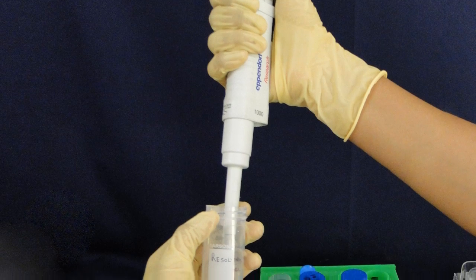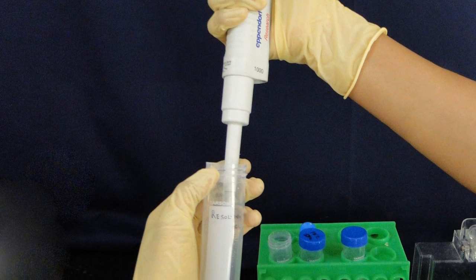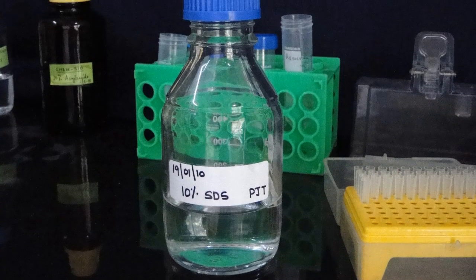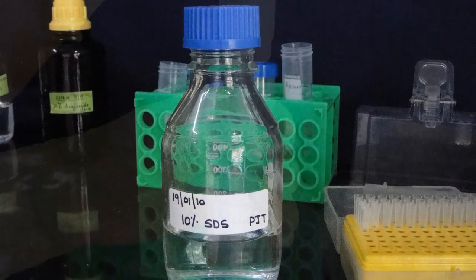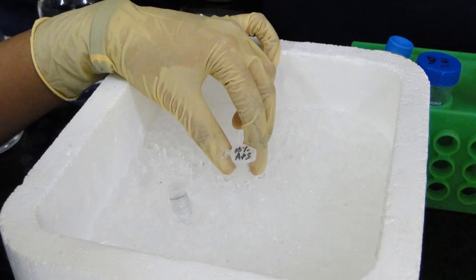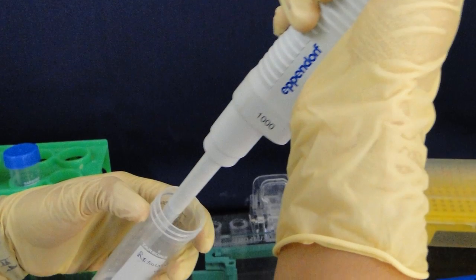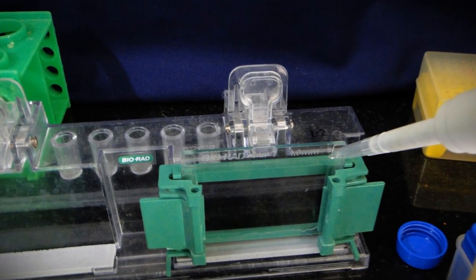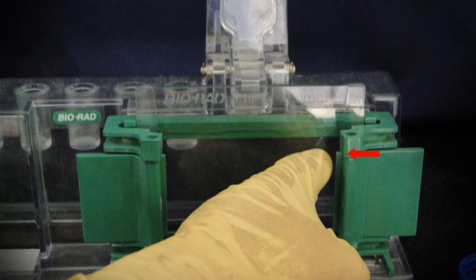Prepare the 10% resolving (separating) gel and 4.5% stacking gel solution by combining all the reagents except ammonium persulfate (APS) and TEMED. Add APS and TEMED to the monomer solution just before pouring it in between the glass plates, and mix well by swirling gently. Pour the solution until it reaches the mark on the glass plate.